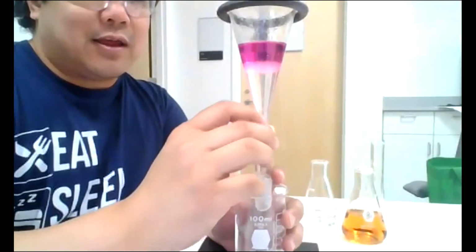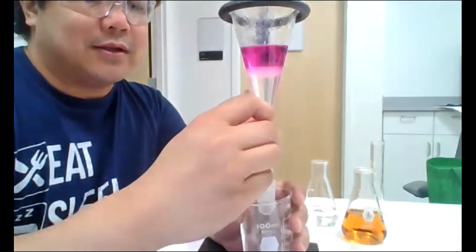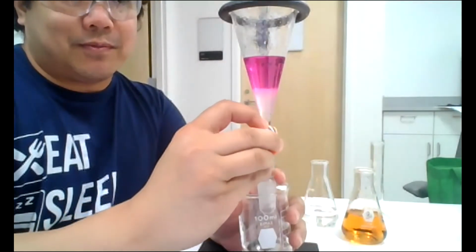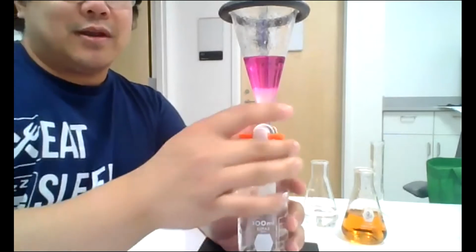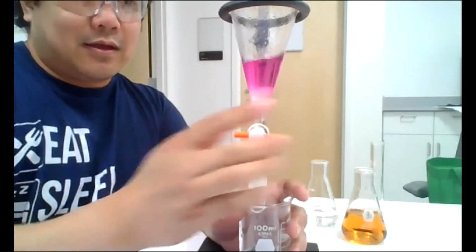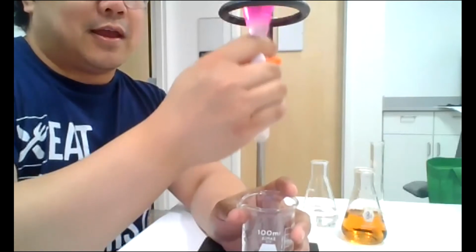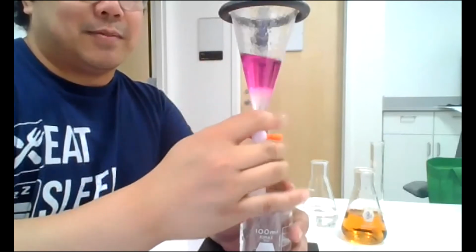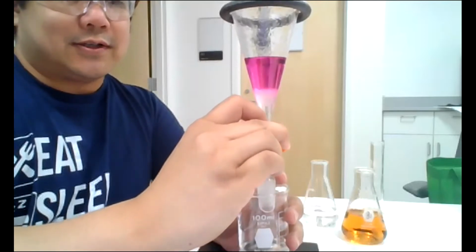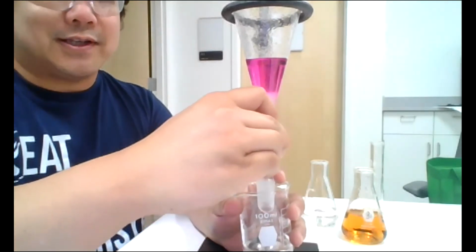So the idea here is you want to drain, but don't get any of the second layer, the top layer, into your beaker. So you can drain slowly. Okay, I don't really want the bubbles there. So my technique is to stop it short and then let it settle a little bit, maybe agitate a little bit. Okay, getting there, right? Again, if your emulsion is bad, it might take a little bit of time, but see, I'm getting more of the clear, colorless solution. Well, from my point of view, it's not quite colorless, and I'll show you in a bit what I'm seeing.